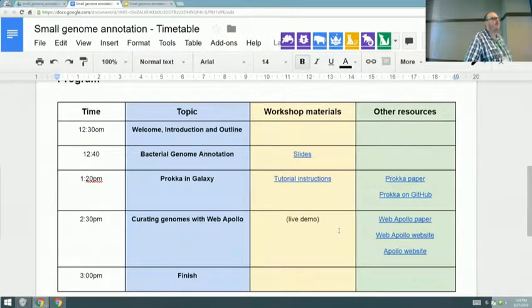It's mainly because I can't distribute it. It's too big to distribute. It's quite painful to distribute my software because of the sizes. You can't put the stuff in GitHub because they're too big. Some of these extra databases that Prokka searches against, you can give it as many databases as you want to search against, but these databases are big. Some of these HMMER HMM ones.